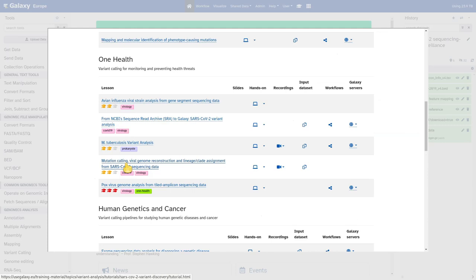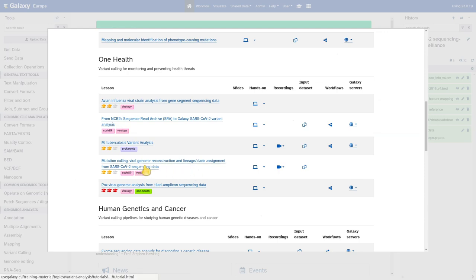Hi everybody, welcome to this brief demo of the tutorial: Mutation Calling, Viral Genome Reconstruction and Lineage Clade Assignment from SARS-CoV-2 Sequencing Data. My name is Wolfgang Mayer. I'm working for the European Galaxy team and I'm going to walk you through the most difficult parts of this tutorial.